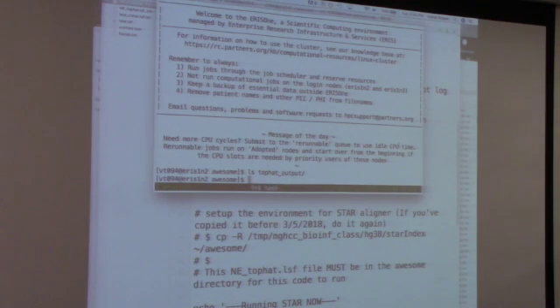Right, right. So wait, if you run the top hat, it's supposed to put your files, but it still doesn't create the output. Well, I have the underscore output with logs and temp, right? But you don't have the BAM file. I don't have BAM files either. We have the logs. Alright, so at least we are closer.